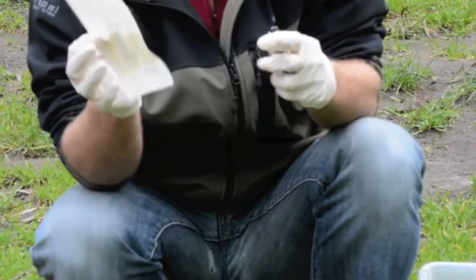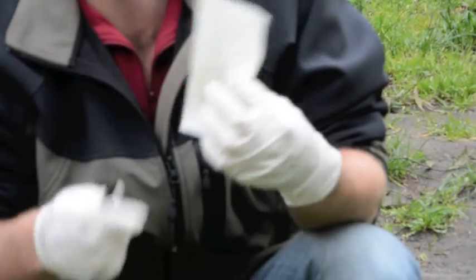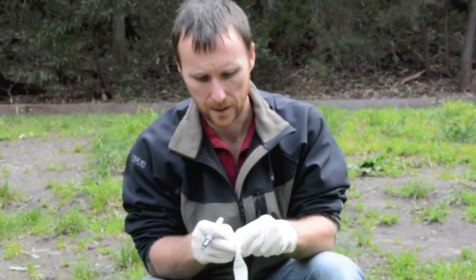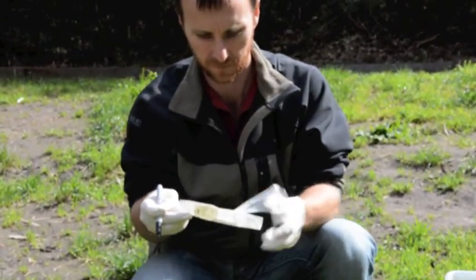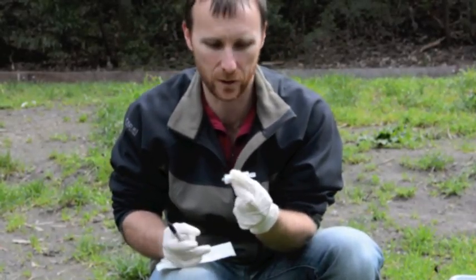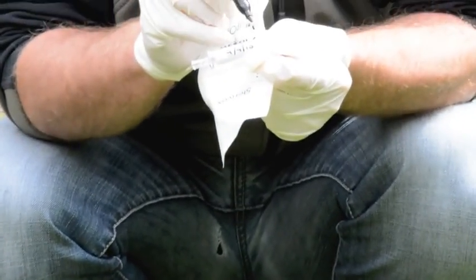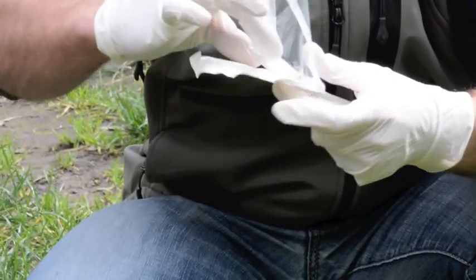Most importantly, we've got to make sure we get the filters labeled properly. Each filter gets labeled both on the outside of the packaging and on the filter itself with the site code and the date. These packages are sterile, so as soon as you open them they're not sterile anymore, but we'll try to keep them as clean as possible. When handling the filter, try to avoid touching either end because that's where contamination can get introduced. The number two on the end indicates this is the second sample taken at this site, followed by today's date.